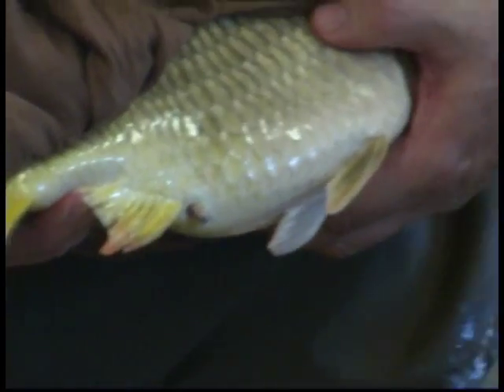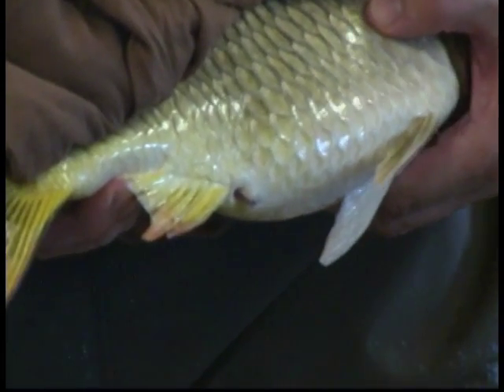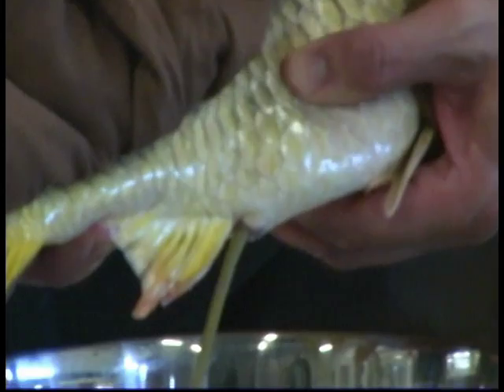When the female is ready, you can see that the eggs flow freely. I press the abdomen a little bit to assist the stripping process.